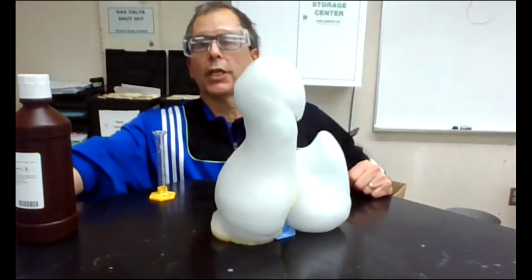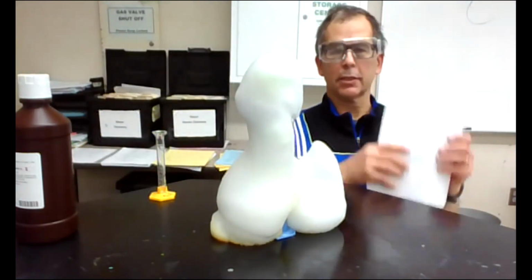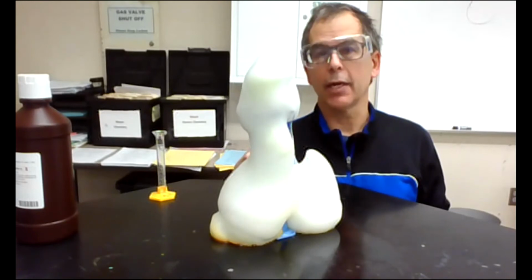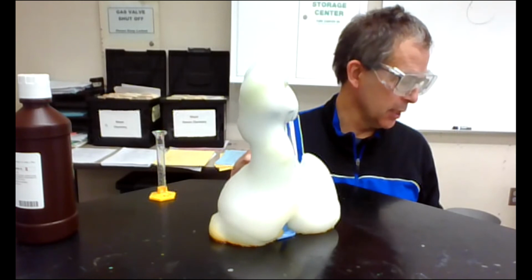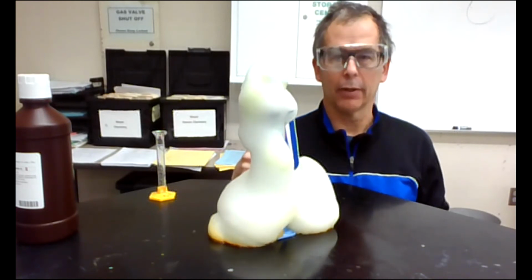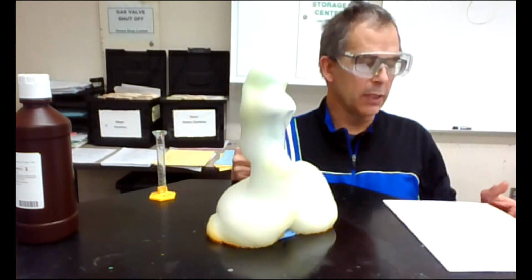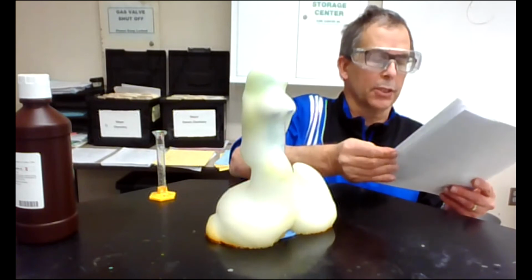So there are a couple of questions in 3 and 4 that we're talking about. One is, what is a catalyst? For now, we're going to say it's something that speeds up a reaction without getting used up in the reaction. That gets to the second question: is a catalyst considered a reactant or product? Not really either, because it's not used up in the reaction. And how is the addition of a catalyst indicated when writing a chemical reaction? We'll have to show that when we go back to our screen share.